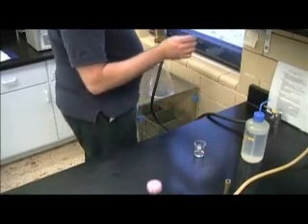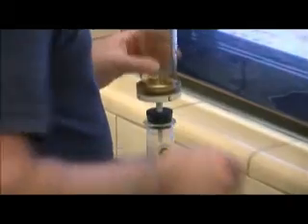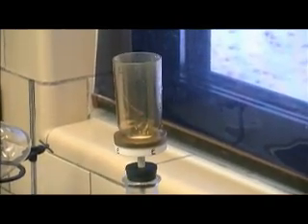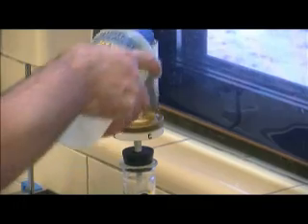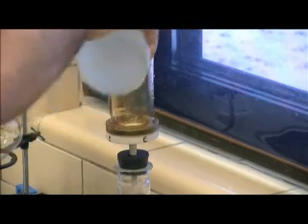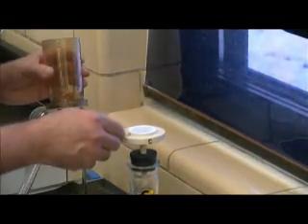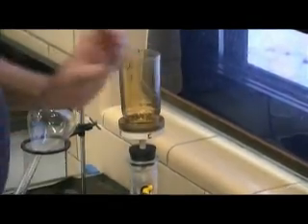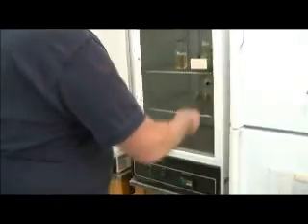Right now, we are watching our microbiologist, Al, perform the membrane filtration test. He's putting a 0.45 micron filter into the filter assembly and then adding 100 mLs of sample to be analyzed. The filter assembly is rinsed with lab pure deionized water as soon as the sample has gone through the funnel. And at this time, Al will then remove the filter and place it onto the media dish for later incubation.